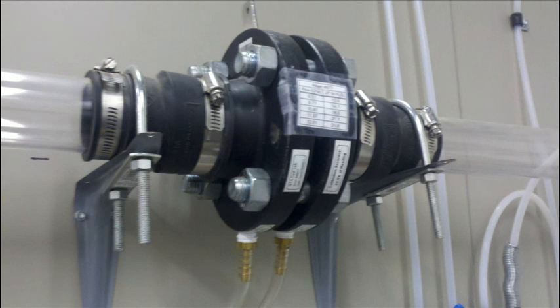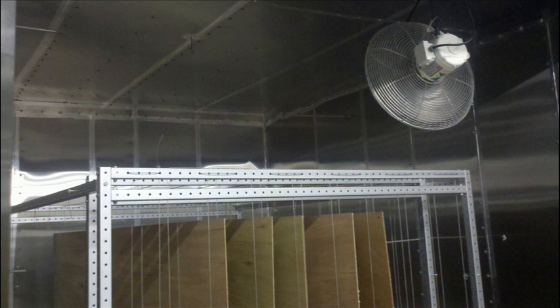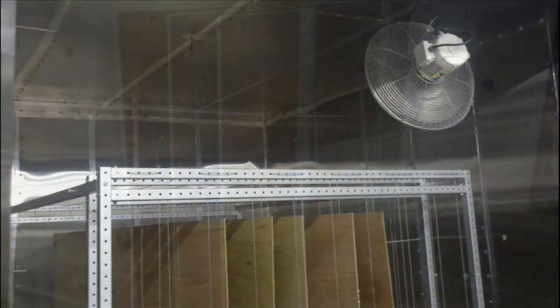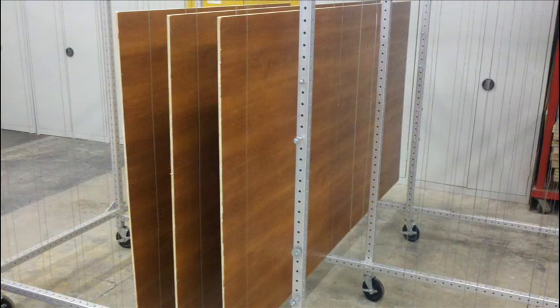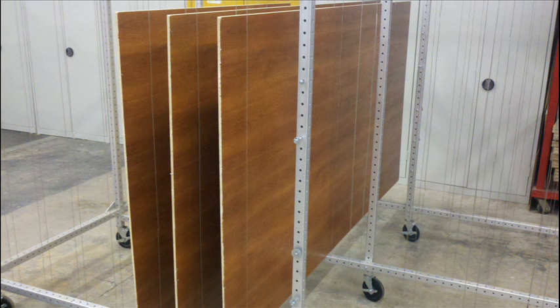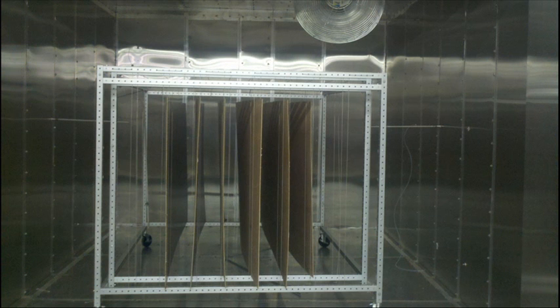ASTM E1333 specifies an air exchange rate of 0.5 air changes per hour, so only the quantity of material tested differs between product types. The test samples are conditioned in a low formaldehyde environment for seven days before being placed in the 800 cubic foot or larger chamber.